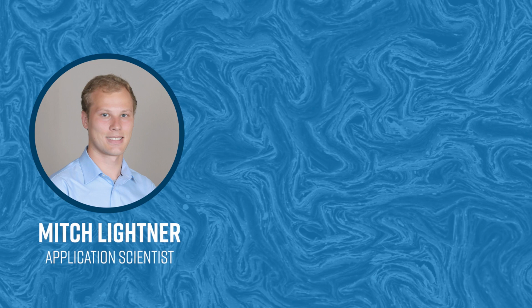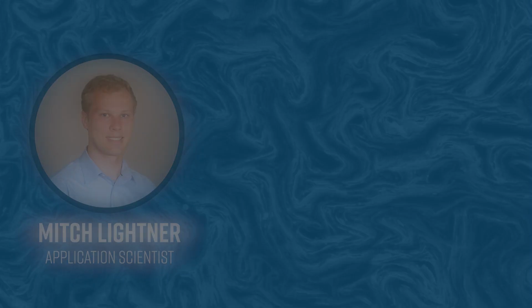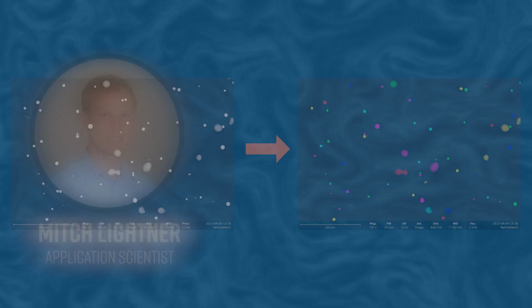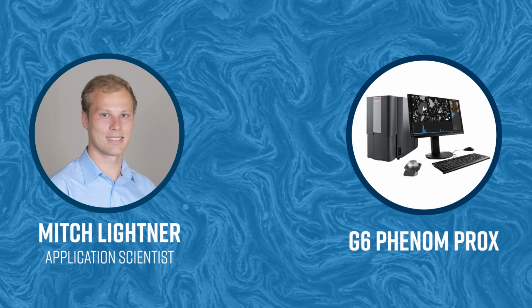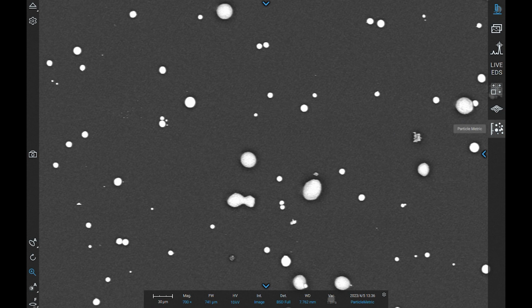Today, I will be walking through the ParticleMetric software, the Phenom SEM's particle analysis tool. This fully integrated software identifies particles in an image while also acquiring vast amounts of dimensional data about those particles. I will be demonstrating its standard workflow on the G6 Phenom Pro X, but these methods work on any Phenom SEM. To start ParticleMetric, select the particle icon on the right-hand side of the screen.